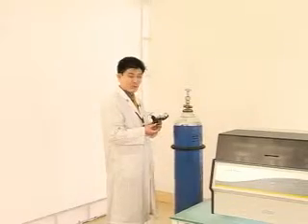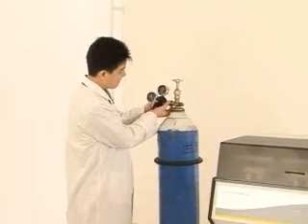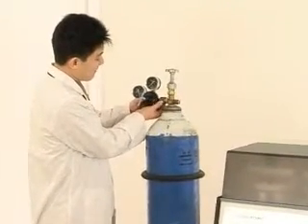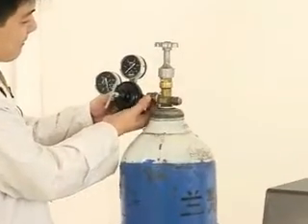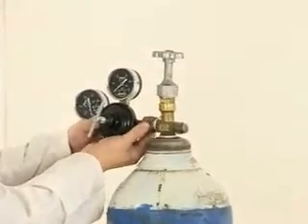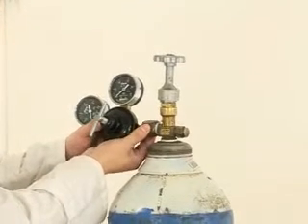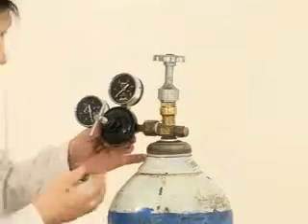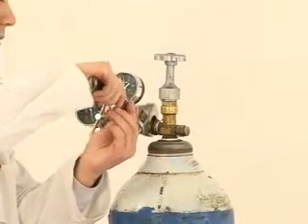Install the output valve to the gas tank. After this, use a spanner to tighten it.